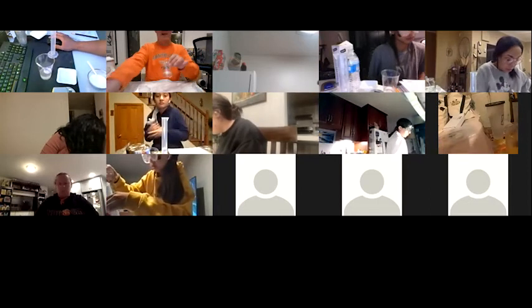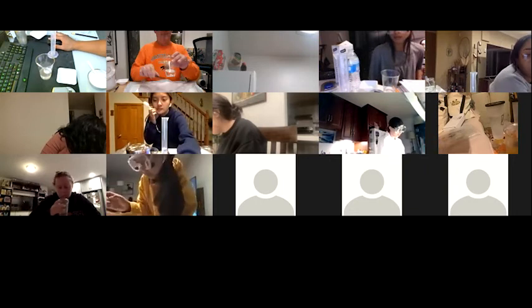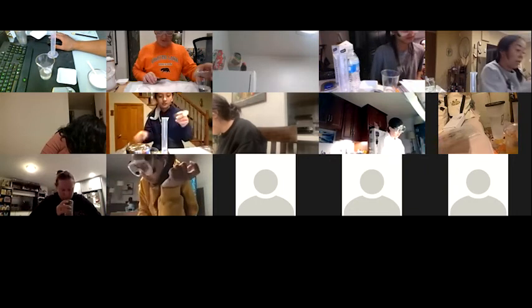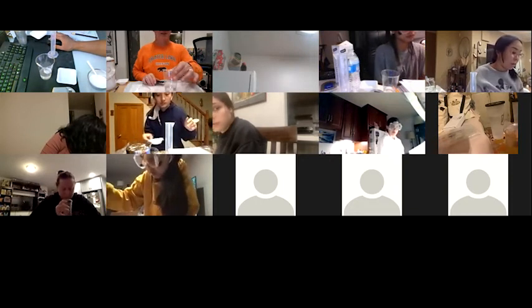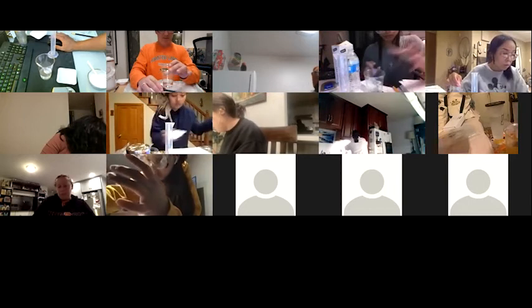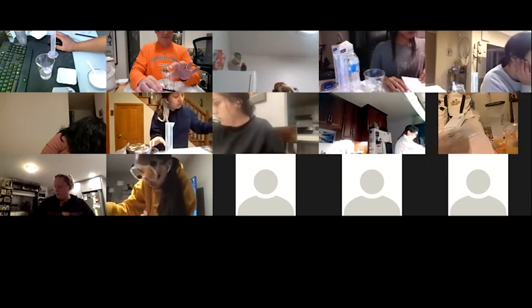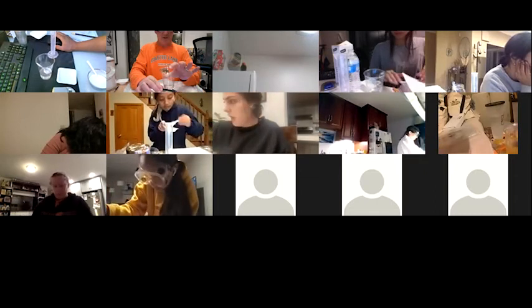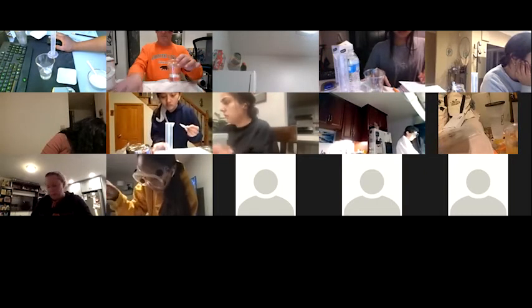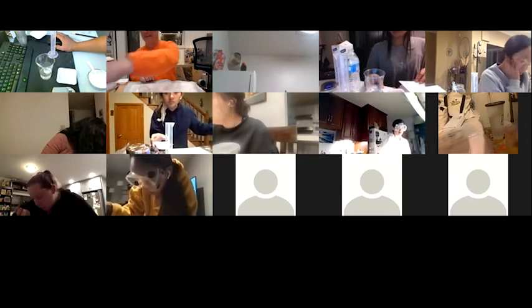Again, it would help to look at it against a dark background. I've got a little diaper on the table in case I spill something, and it's white, so I can't really see white crystals. But if you have something dark, it's real easy to see. I don't see any little floaties, so I think I'm good to go. So that would be my 10%.